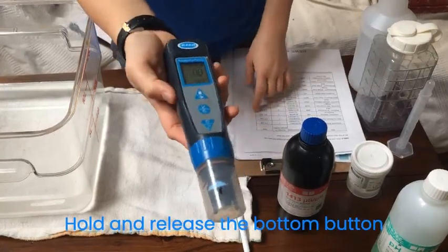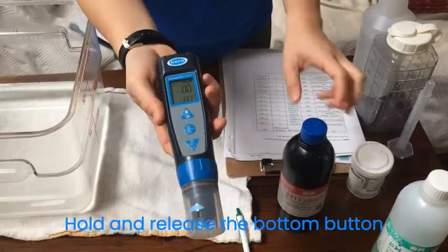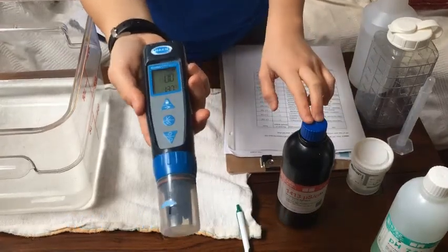You're going to do two different calibrations: one is for pH and one is for conductivity.